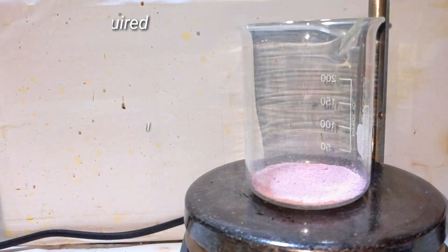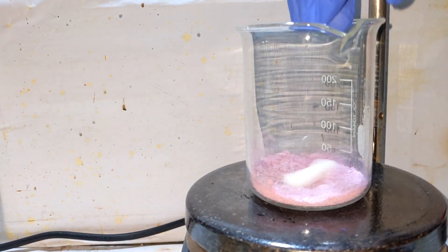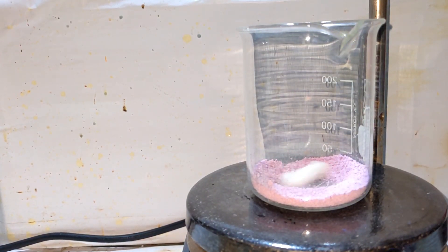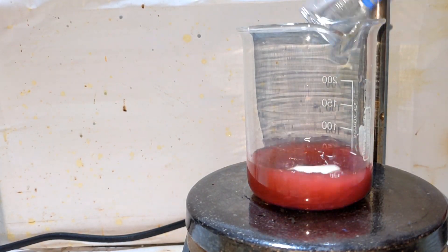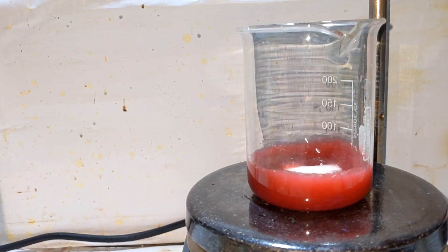12 grams of cobalt(II) chloride was placed in a beaker on a stir plate. A stir bar was then introduced and 35 milliliters of distilled water was added to make a solution of cobalt(II) chloride.